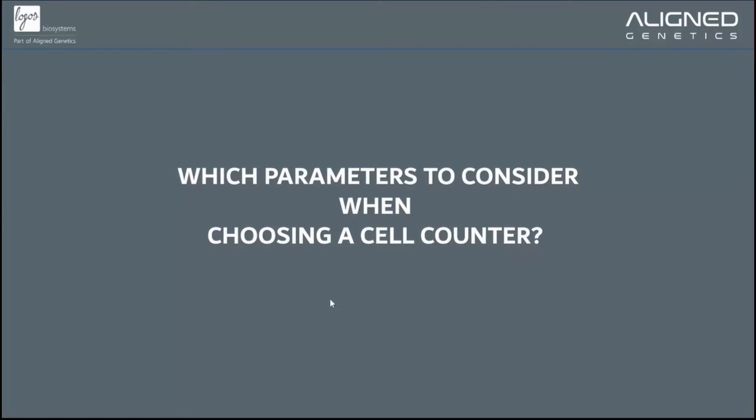The next question is, is it enough? Is it sufficient to ensure that your counts are reliable? The answer is no. You need to consider extra parameters. And here I selected the specific parameters that I consider as critical when choosing the cell counter.